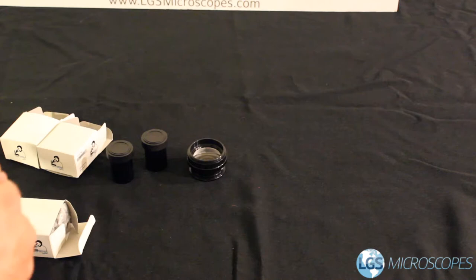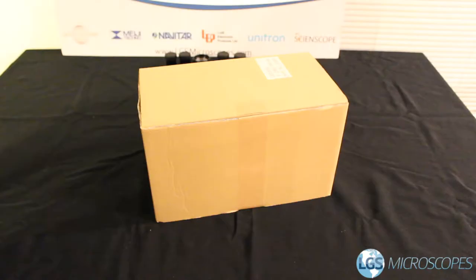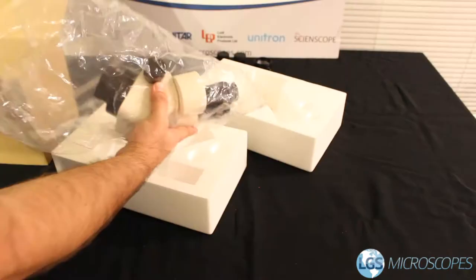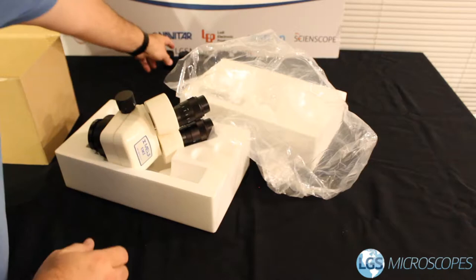The first thing we want to do is unpack everything and set it aside nicely so we can see what we're working with. In these packages there will be duplicates — some are the auxiliary lenses and some are the eyepieces. Next we'll unbox the microscope heads. Here we have the microscope head. There are going to be some covers throughout the system that we'll want to remove, and the eyepieces also have some covers you'll want to remove as well.